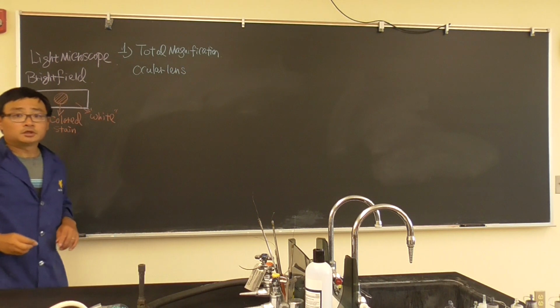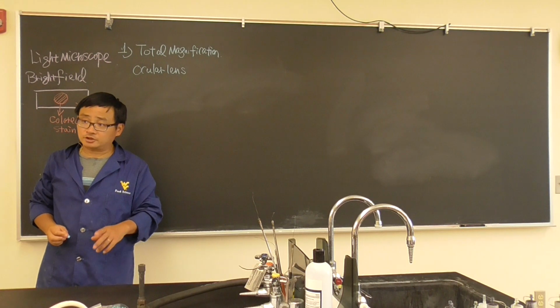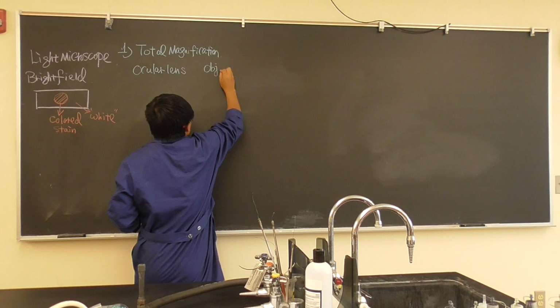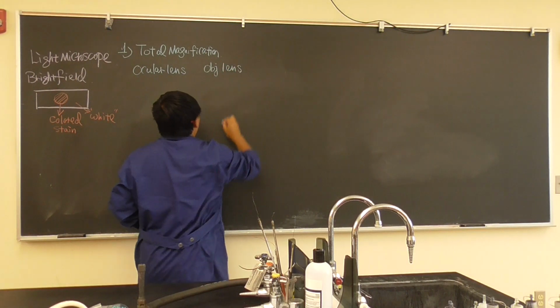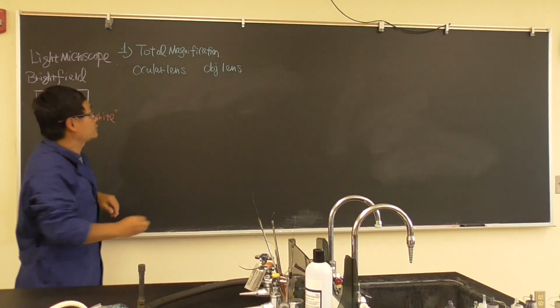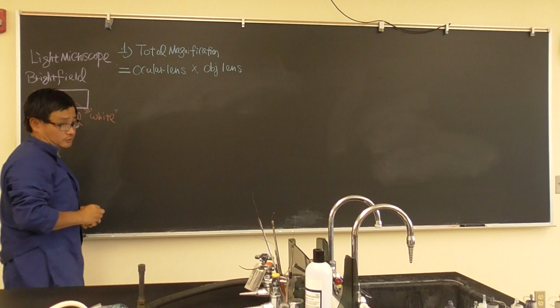Another one is the lens which will touch the specimen. That is called the objective lens.